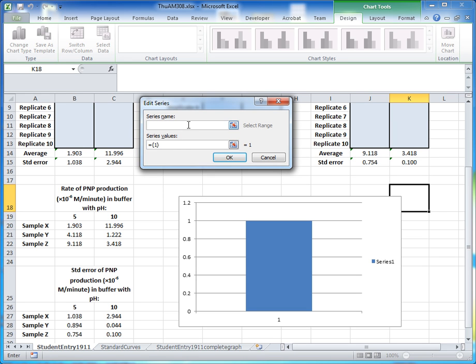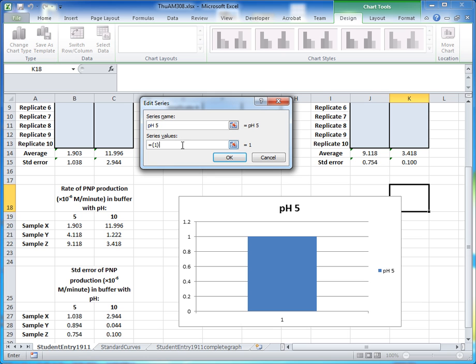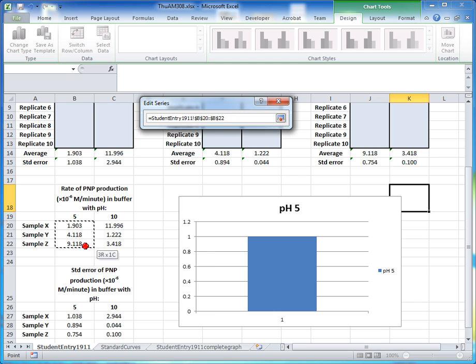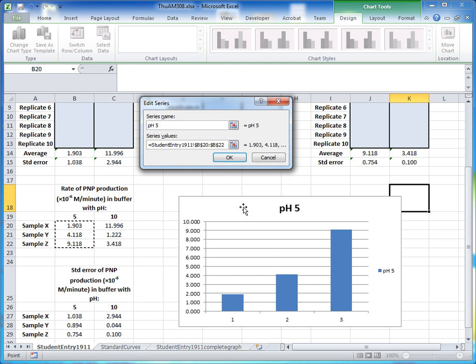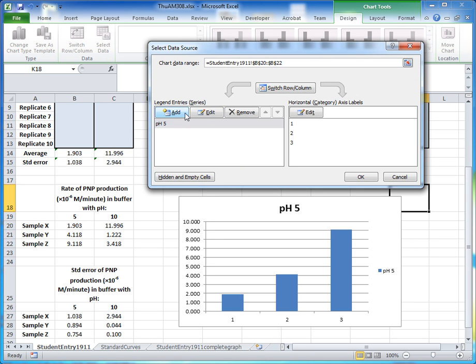It will ask for the series name and values to plot. For the series name, type 'pH 5'. For the series values, press Backspace to clear the text box, then click into the box, come back to the spreadsheet, and highlight the pH 5 average values for samples X, Y, and Z. The graph already shows these values as our pH 5 series. Click OK.